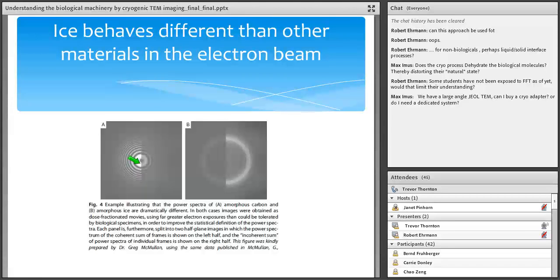The easiest way to think about that is when the electron beams refocus back onto itself to form a point, it doesn't meet in the same place depending on where the ray is coming from in the electron lens. That's because the electron lenses that we use are not perfect, and so they basically spread the beam out over a certain distance. In my microscope, that's 2.7 millimeters, and so you get an imperfect sort of image out of it.